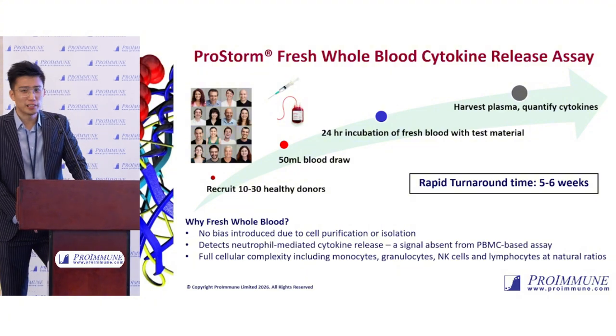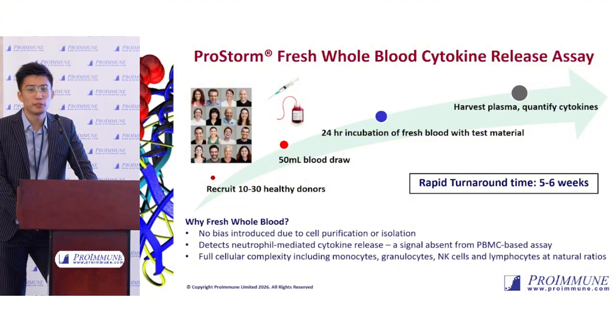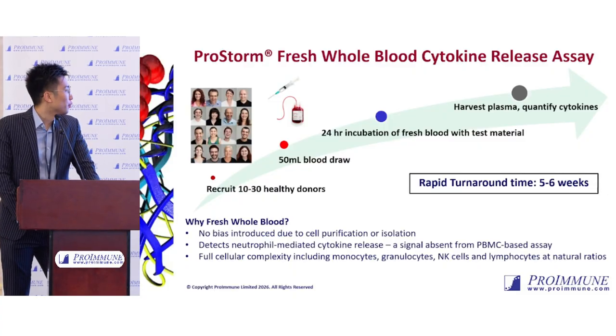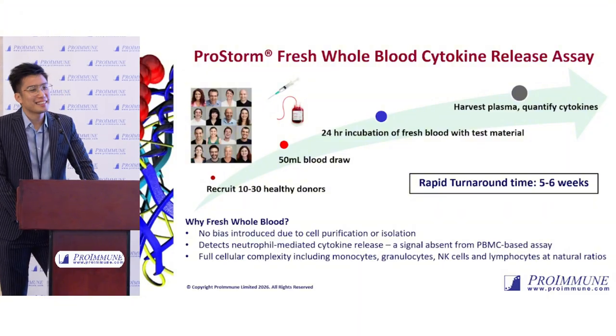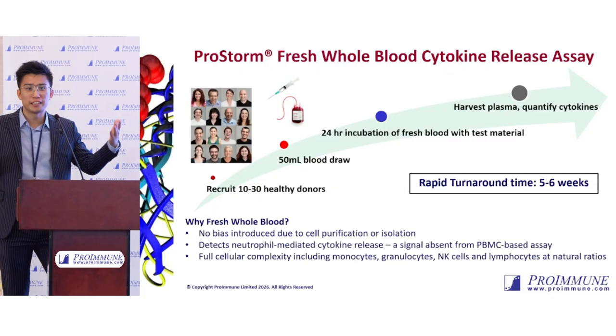So the big question comes in, right? There are different ways that you can do it. You got PBMC-based assay, so why fresh whole blood? The easy answer is, why not? In this case, the whole blood has no bias introduced, because there's no cell purification or isolation. It's just undiluted fresh whole blood.